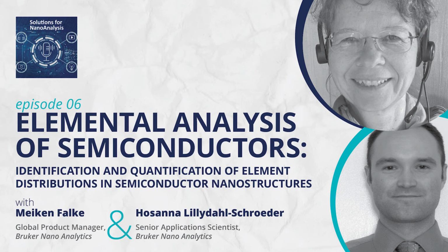The efficiency for light elements is so high, and also good for deconvolving light elements and overlapping M and L lines, that now the investigation of even boron doping and also nitrides in the semiconductor industry became actually routine.